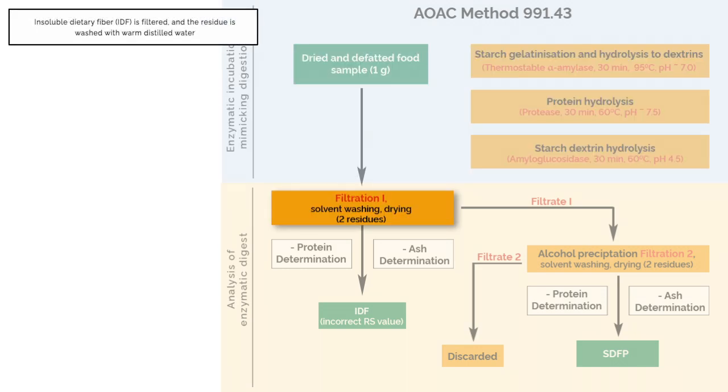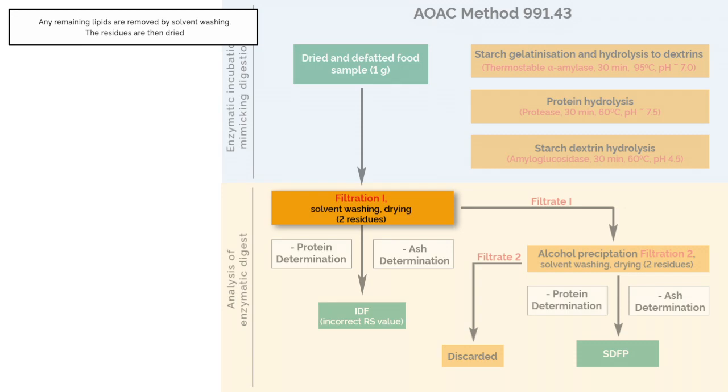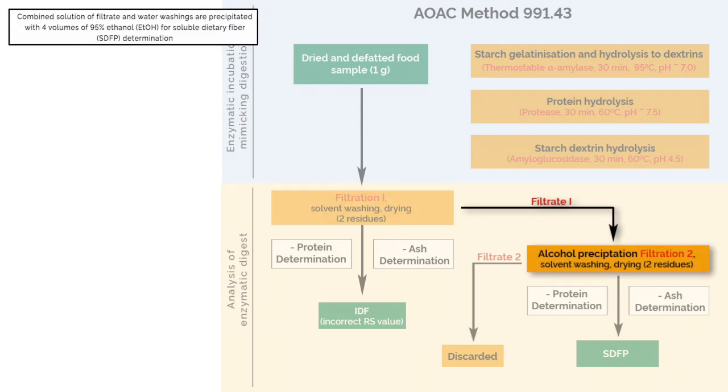Insoluble dietary fibre is filtered and the residue is washed with warm distilled water. This process separates the insoluble dietary fibre from the soluble dietary fibre that is soluble in water but precipitates with 80% ethanol. Once filtered, any remaining lipids are removed from the IDF residue by solvent washing and the residues are then dried. For soluble dietary fibre determination, the combined solution of the filtrate and water washings are precipitated with 4 volumes of 95% ethanol. The precipitate is then filtered, washed with solvents to remove any remaining lipids, and dried.